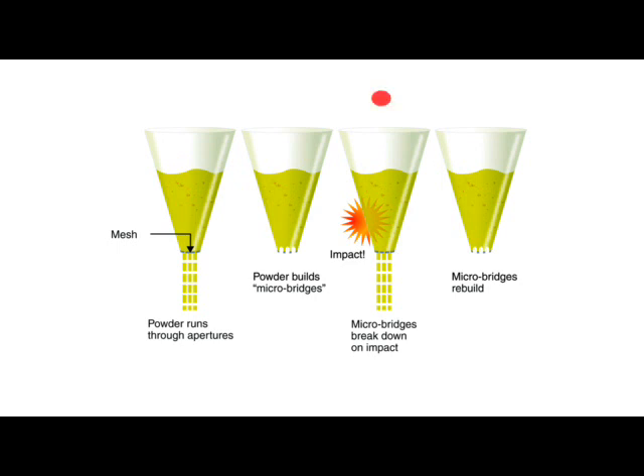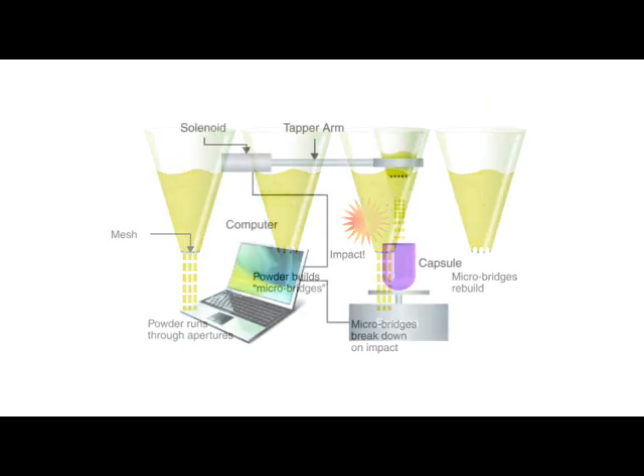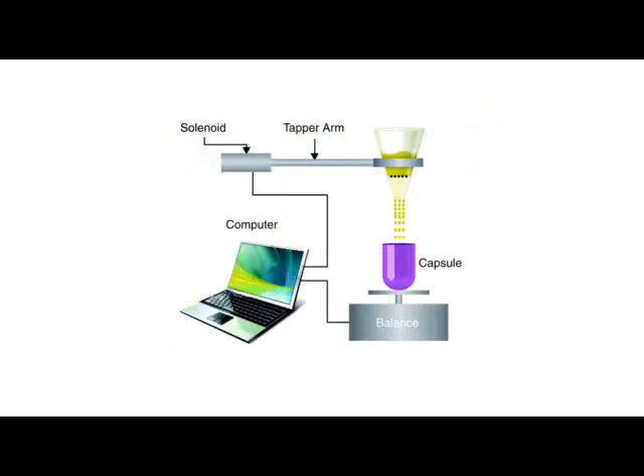When the tapping motion starts again, powder falls until the tapping stops and micro bridges are reformed. The amount of powder dispensed is monitored by a closed loop dispensing control algorithm. This calculates the number of taps required to reach the desired target weight. The fill weight is monitored throughout the filling process. At the end of the dispense, the balance settles and the final weight is recorded.